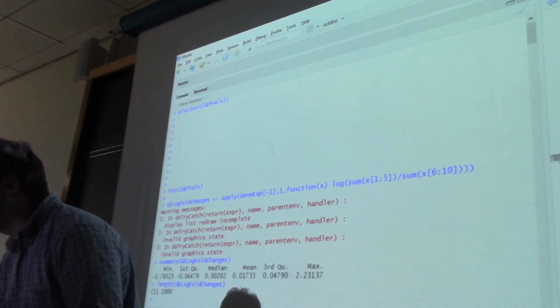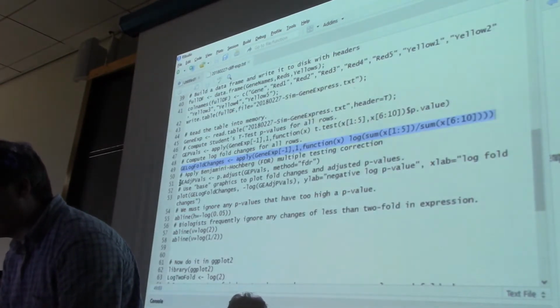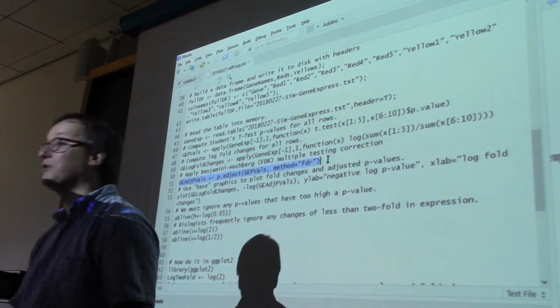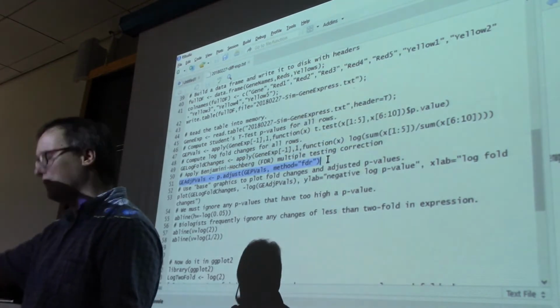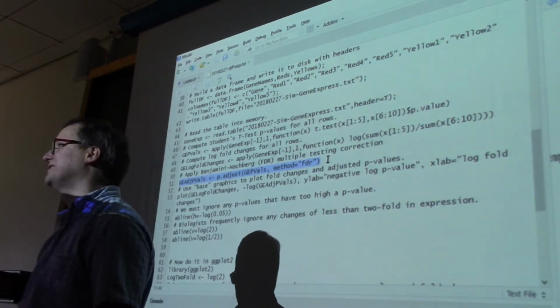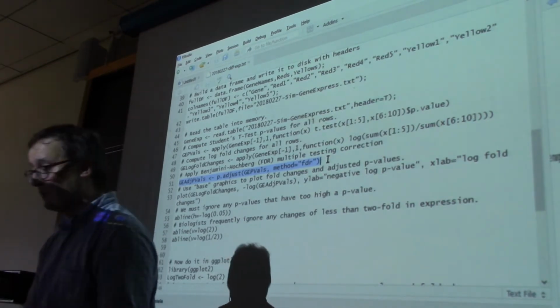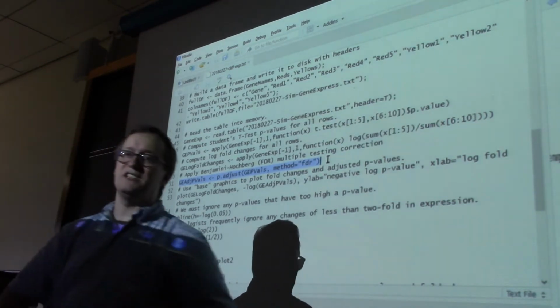All right, let's return to our script. What's our next line? Ah, this is one of my favorite concepts to talk about. And you can be sure in the Biostatistics unit, my division, we're going to be talking about multiple testing correction because darn it, we have to use this. It's one of my favorite things to pester people about at their defenses, seriously. So, we are going to adjust these p-values.